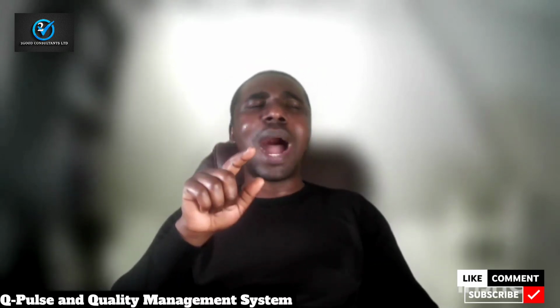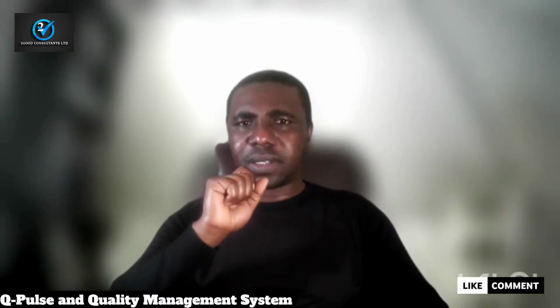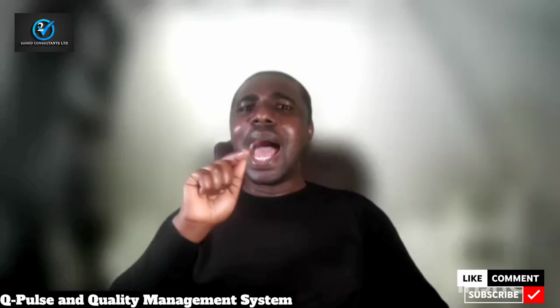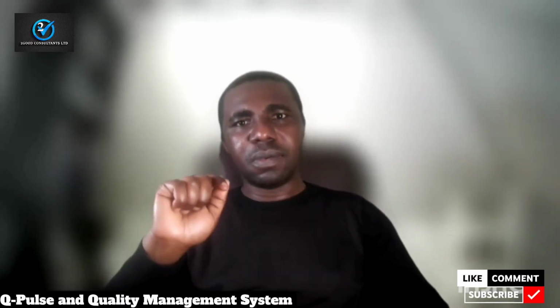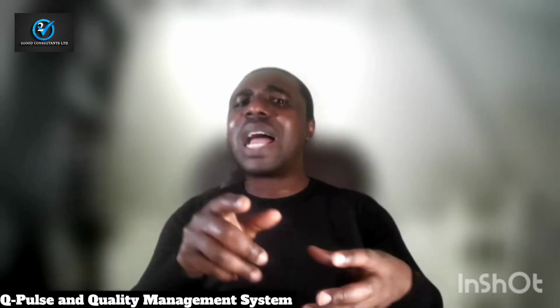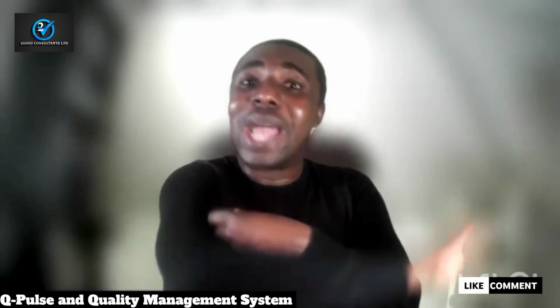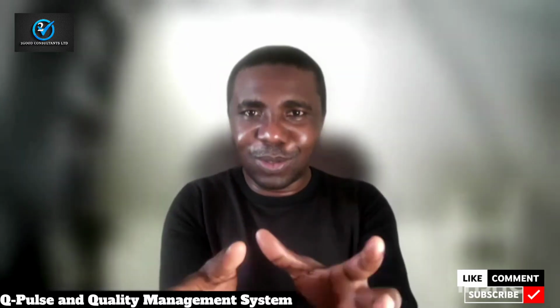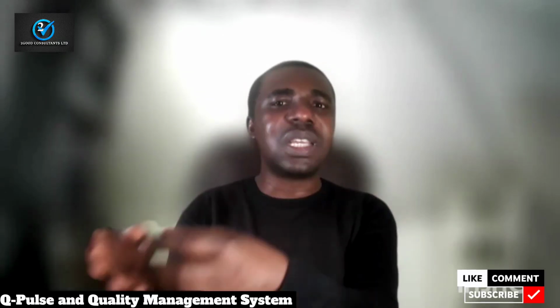Imagine that you are training somebody, a new member of staff. You are training the person, and you've gone on maybe, let's say, annual leave, and you come back. Most times, it will take electronic documentation to know where you stopped, to know where to start. Does that make sense? Now, let's say there is an incident that occurs in the lab, and you are raising a CAPA, as the case may be, for that.